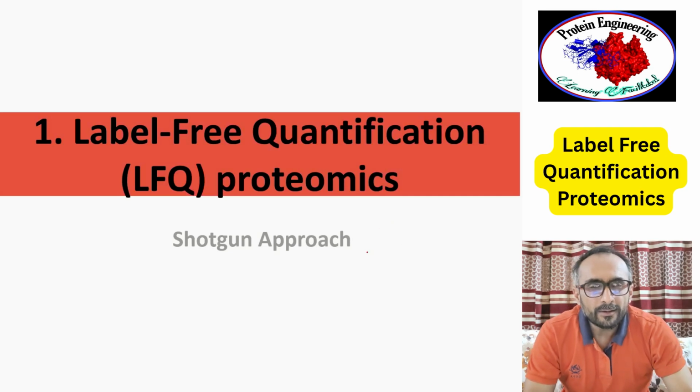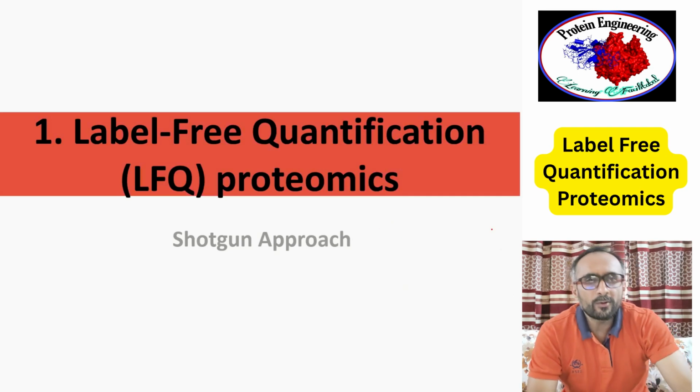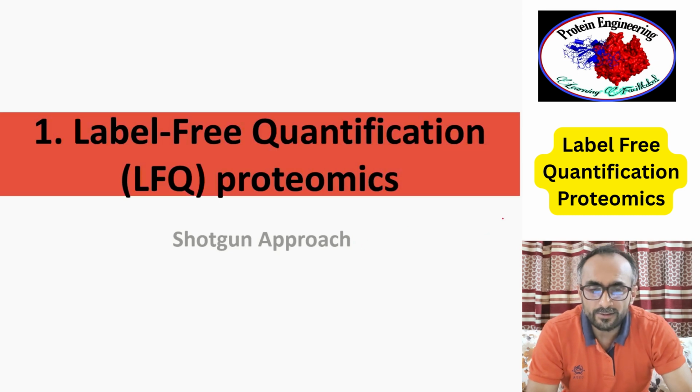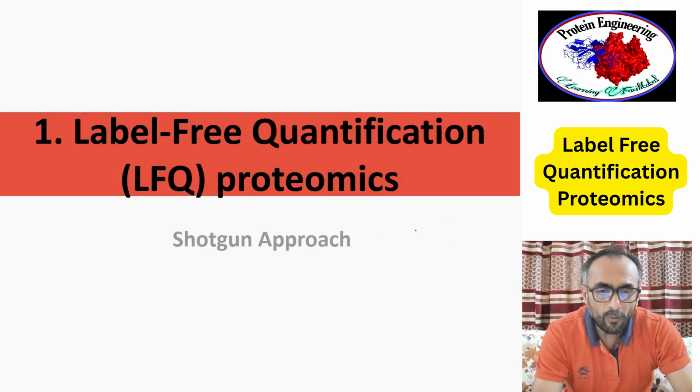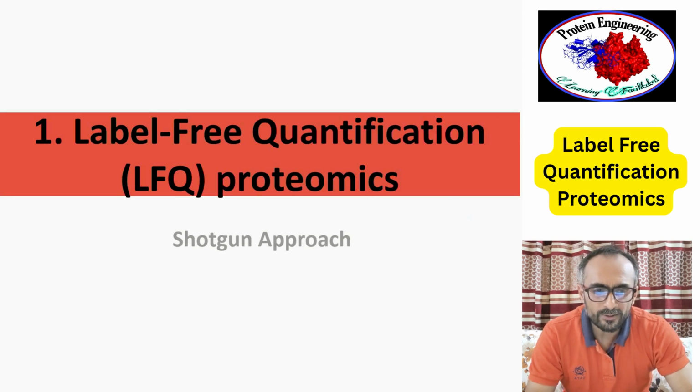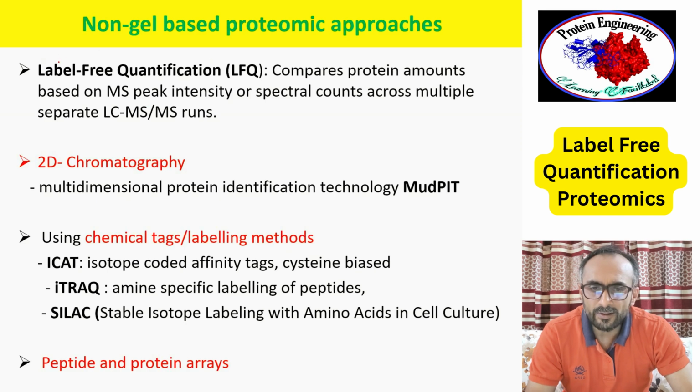Hello everyone. In this lecture we'll talk about one of the non-gel based approaches, called label-free quantification techniques, to study the proteome. As we know, the proteome, which is 10,000s of proteins present in a cell, can be separated either by gel-based approaches like two-dimensional gel electrophoresis, or by gel-free methods. So one of the gel-free methods is label-free quantification.